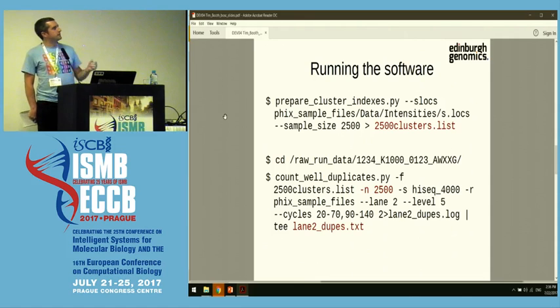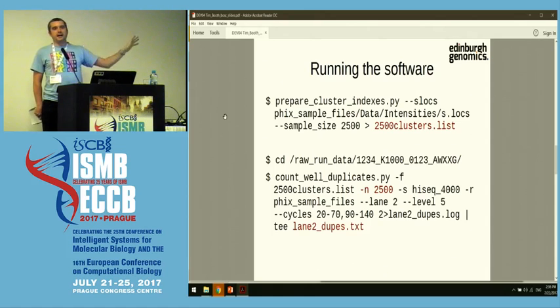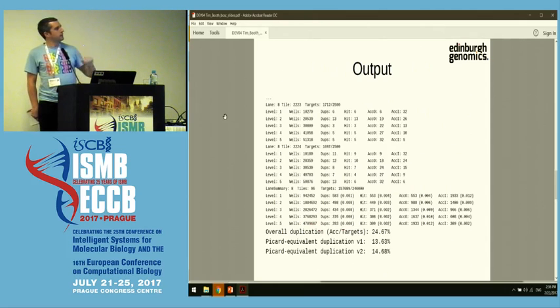You can run the software very easily. The first step prepares a map of all the indices you're going to sample — it looks at the geometry of the flow cell and comes up with a sampling strategy. The second command actually counts the duplicates and generates a report. The report gives you various details, but what you care about is right at the bottom: there's an overall duplication count showing the number of wells found to be duplicated, and also a scaled equivalent value which is comparable to what Picard gives as the duplication rate.